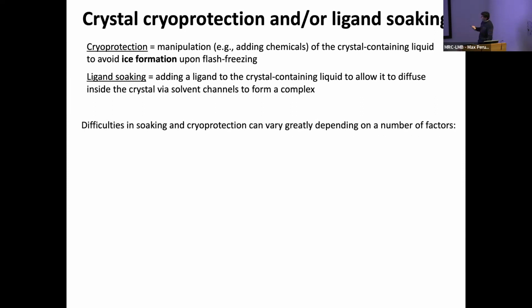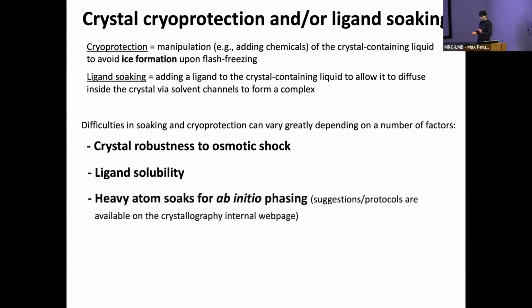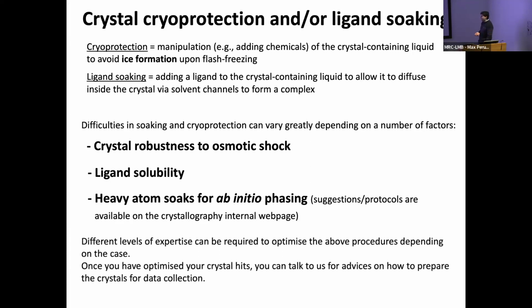So the difficulty in soaking and cryoprotection can vary greatly; it all depends on your samples. It will depend on the robustness of your crystal to osmotic shocks, and the solubility of your ligand, whether it's soluble in DMSO or in water. There are even more problems if you have to do back-soaks. But this is not the place to discuss these problems. If you need to do something like that, we can sit down and discuss the best way to proceed for your project.